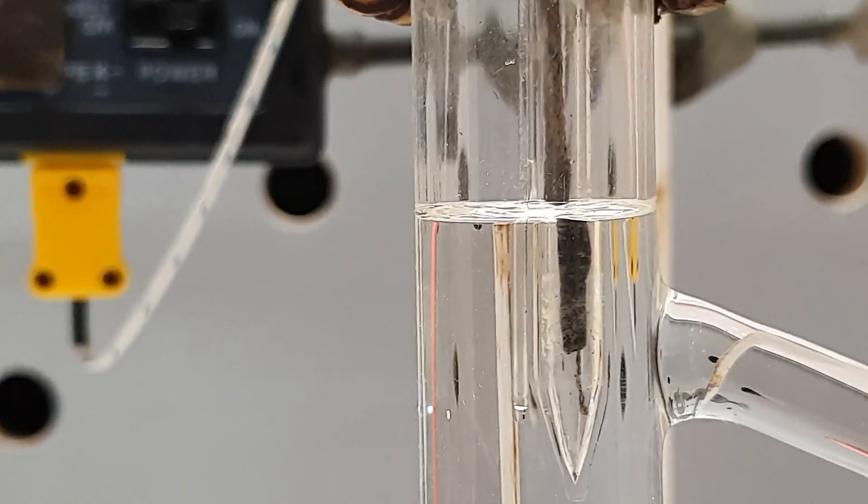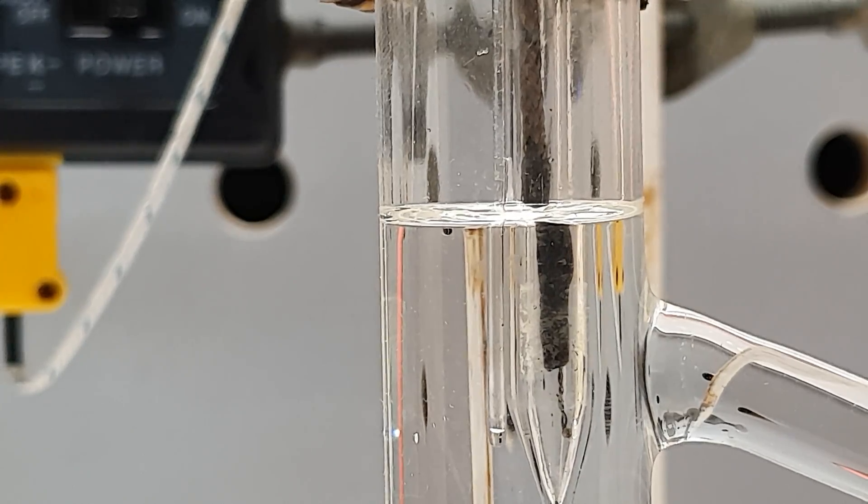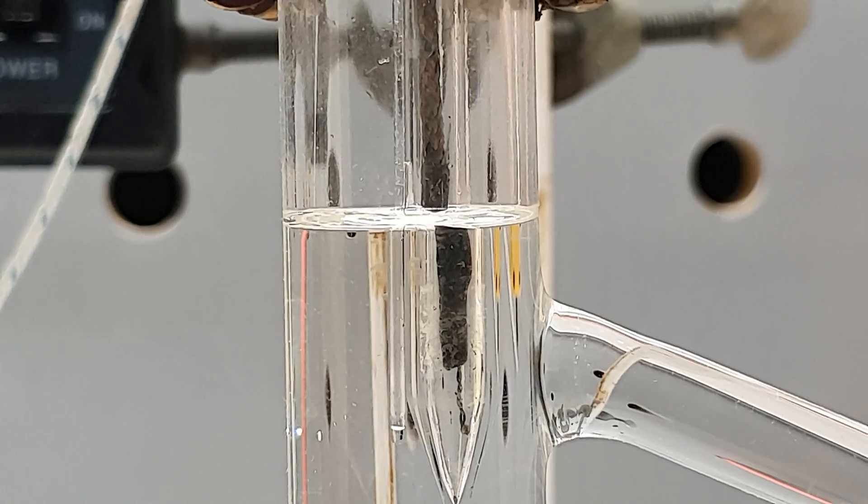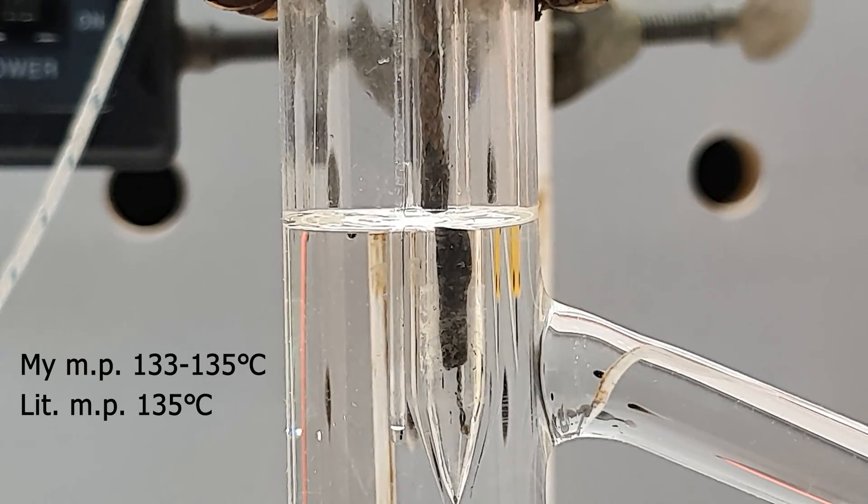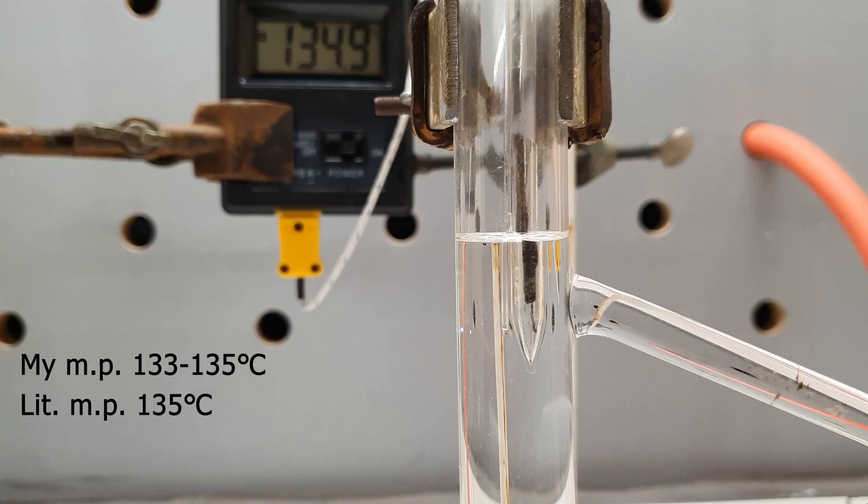When the melting point is reached the solid in the capillary melts and becomes transparent. If the compound is pure this will happen in a very tight temperature interval which is characteristic of every compound. In my case the solid melted between 133 and 135 degrees Celsius which corresponds well to the literature melting point of aspirin which is 135 Celsius. After all my thermocouple has a 1 degree error interval.